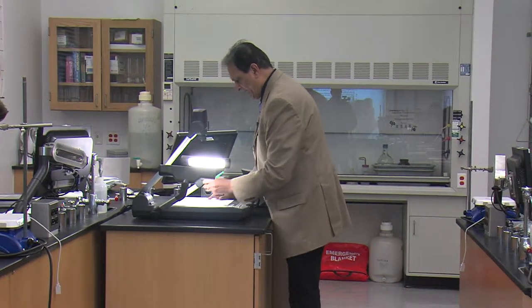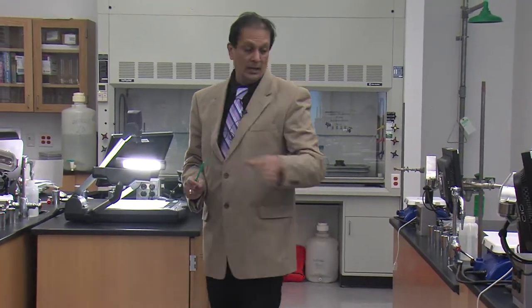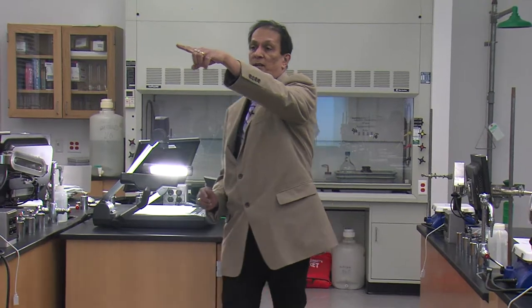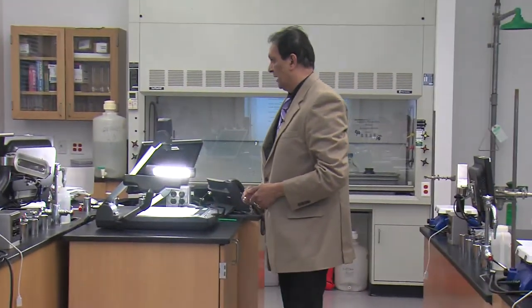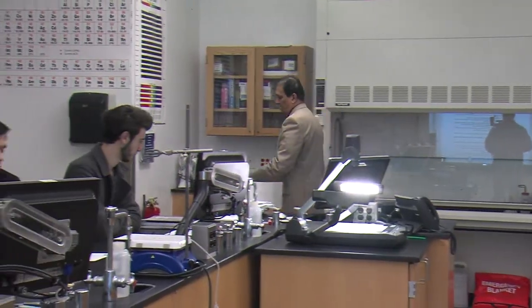At the end of the lab, you should clean your area. Area means the tabletop you're seeing now, which has been cleaned for you, so it should be cleaned. We have a blue sponge over there. Do you see that blue sponge? Make sure that you grab that blue sponge and wipe the tabletop at the end of the day. All the supplies are kept over here.